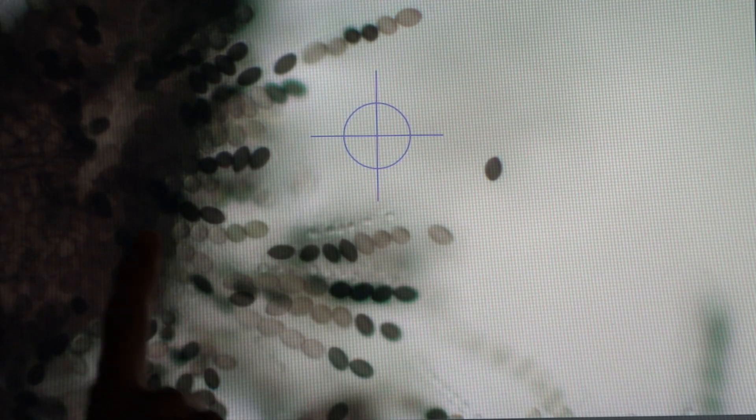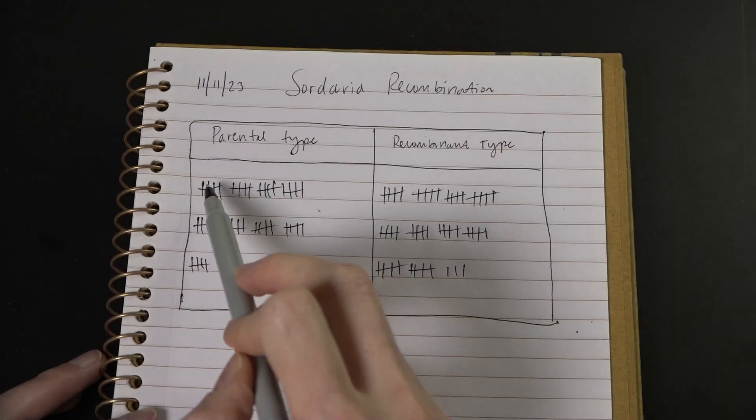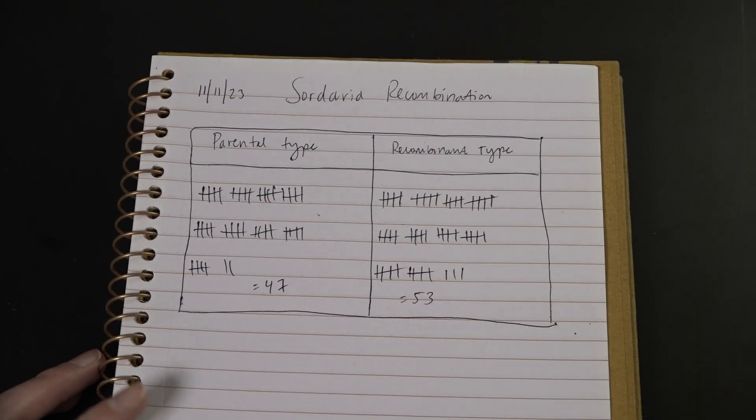I'm going to count at least 100 asci and score them as either parental type or recombinant type. I'm tallying them in a table as I go to help keep track.